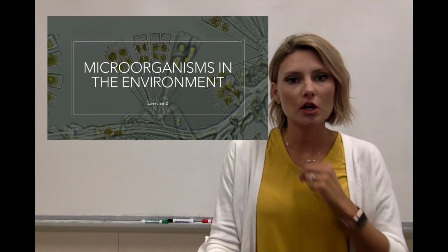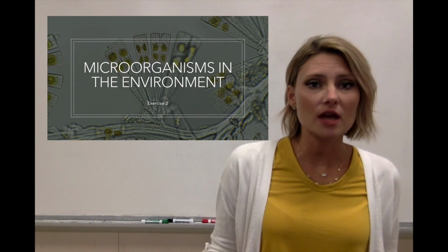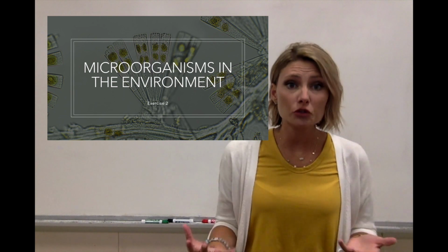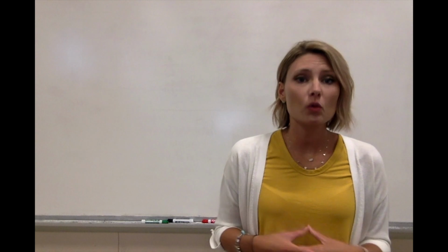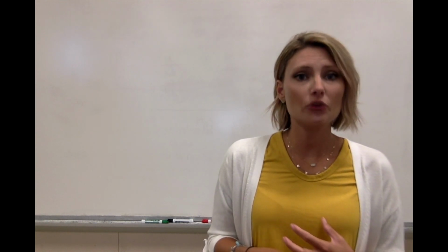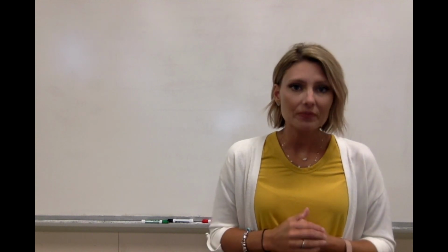Today we are going to be going over microorganisms in the environment, which is exercise 2 in your lab manual. What I'm basically going to do is introduce you to where microorganisms are growing, and then we're going to go over a little bit about media, which is how we grow the organisms in the lab, how we visualize them in the lab.